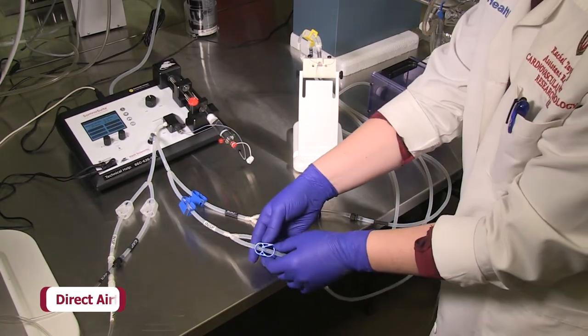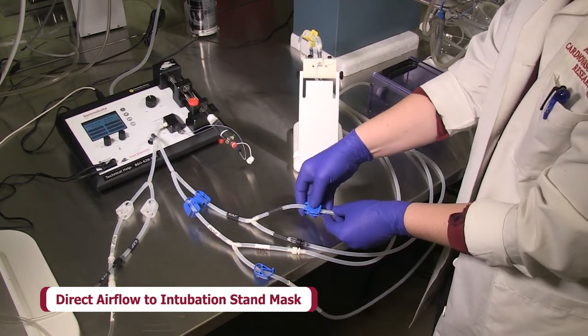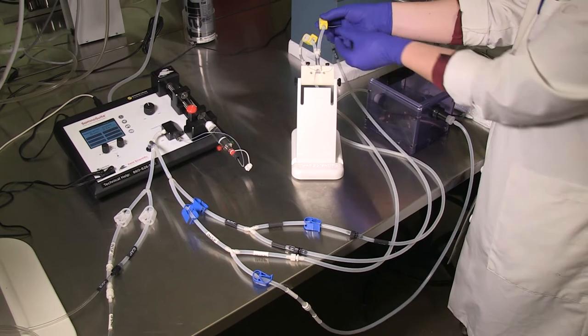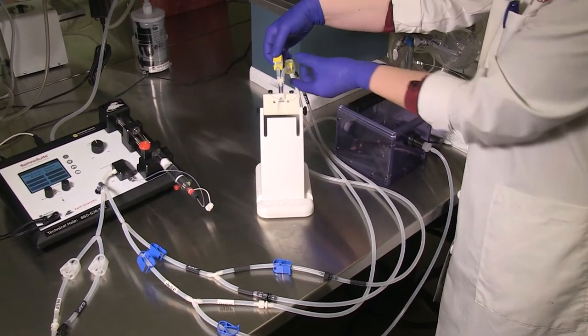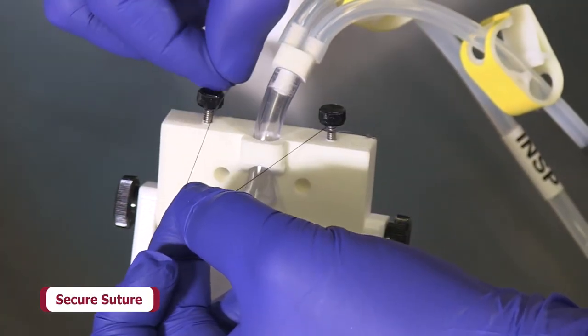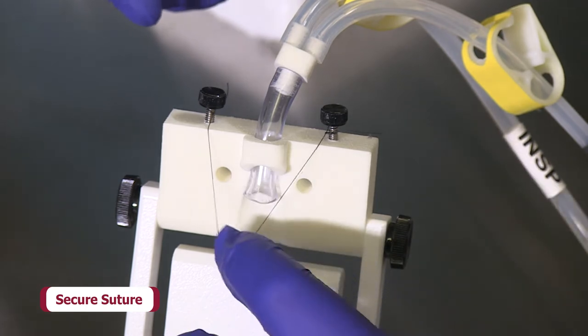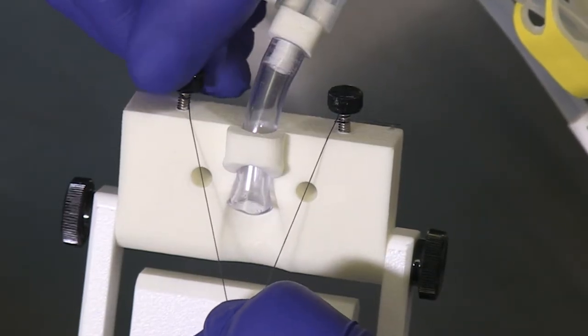First, direct airflow to the intubation stand mask by connecting the integrated anesthesia mask tubing to your anesthetic vaporizer. The intubation stand includes tubing and a few connectors to select from. Secure an adequate length of the included suture to the screws on top of the stand. This will be used to secure the animal's incisors and stabilize the head.